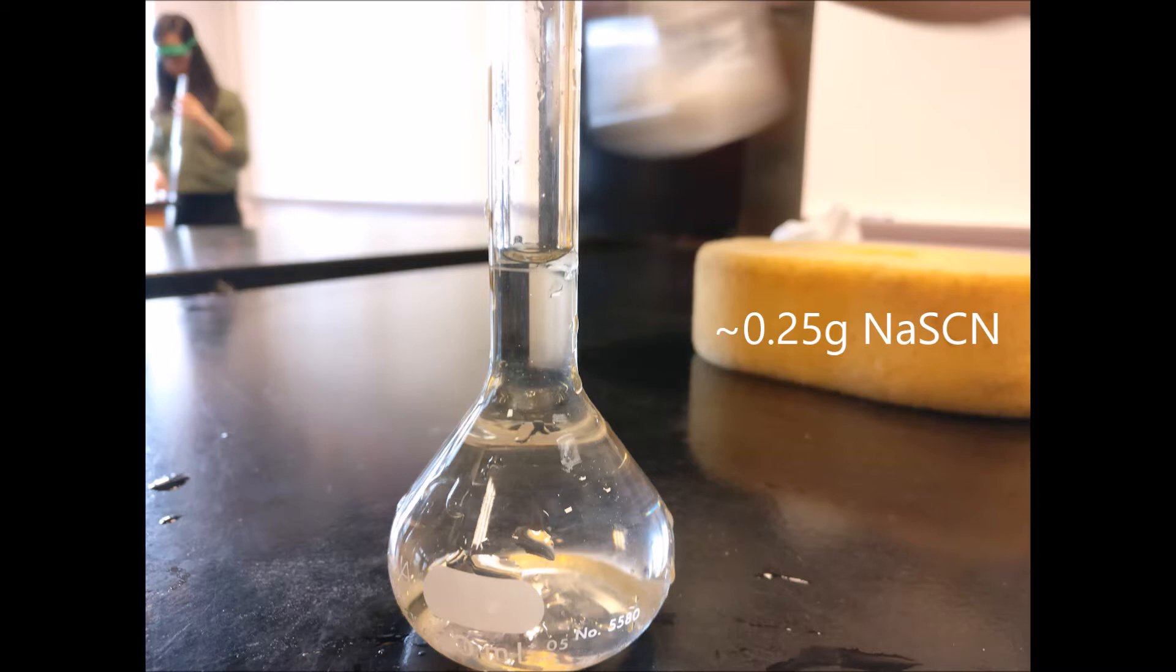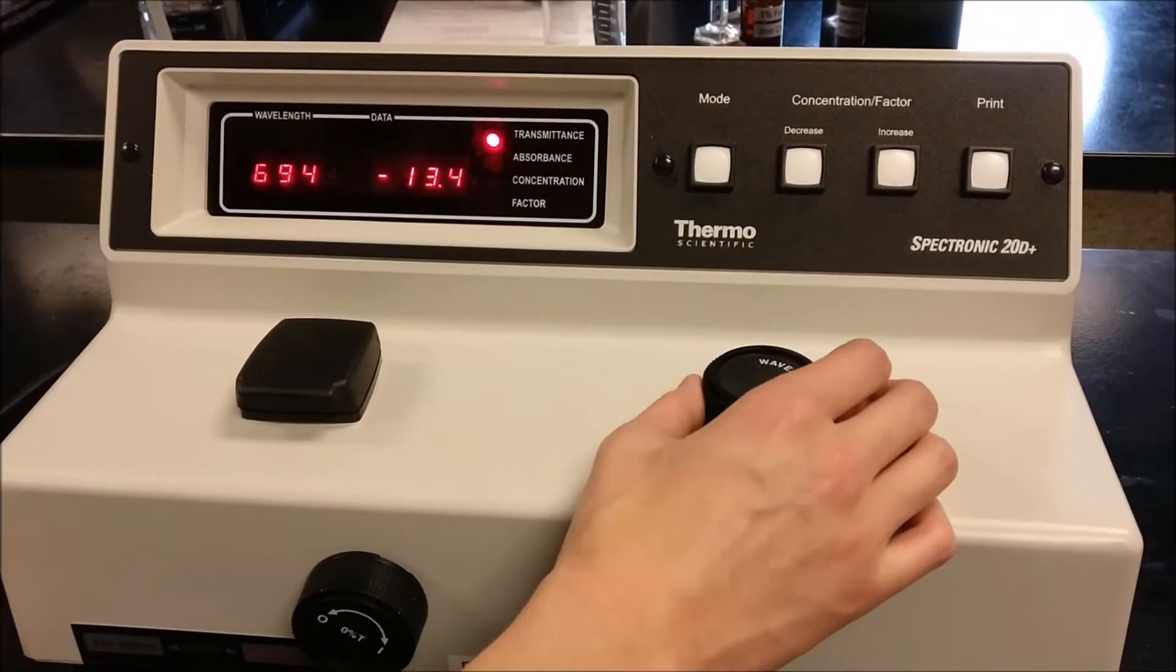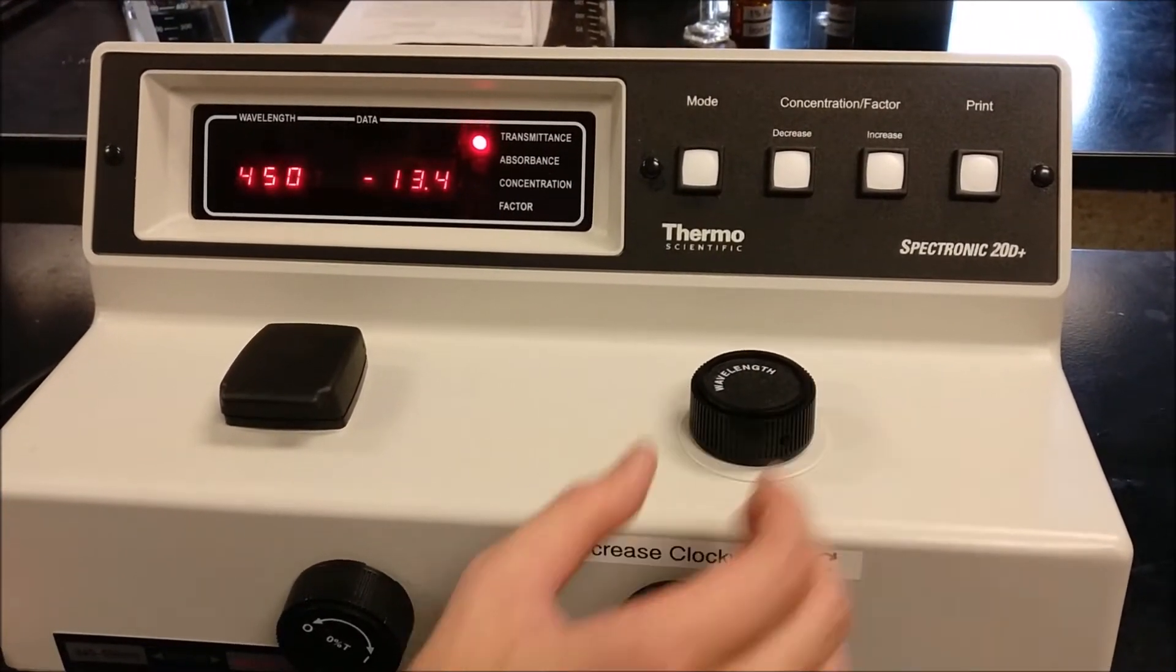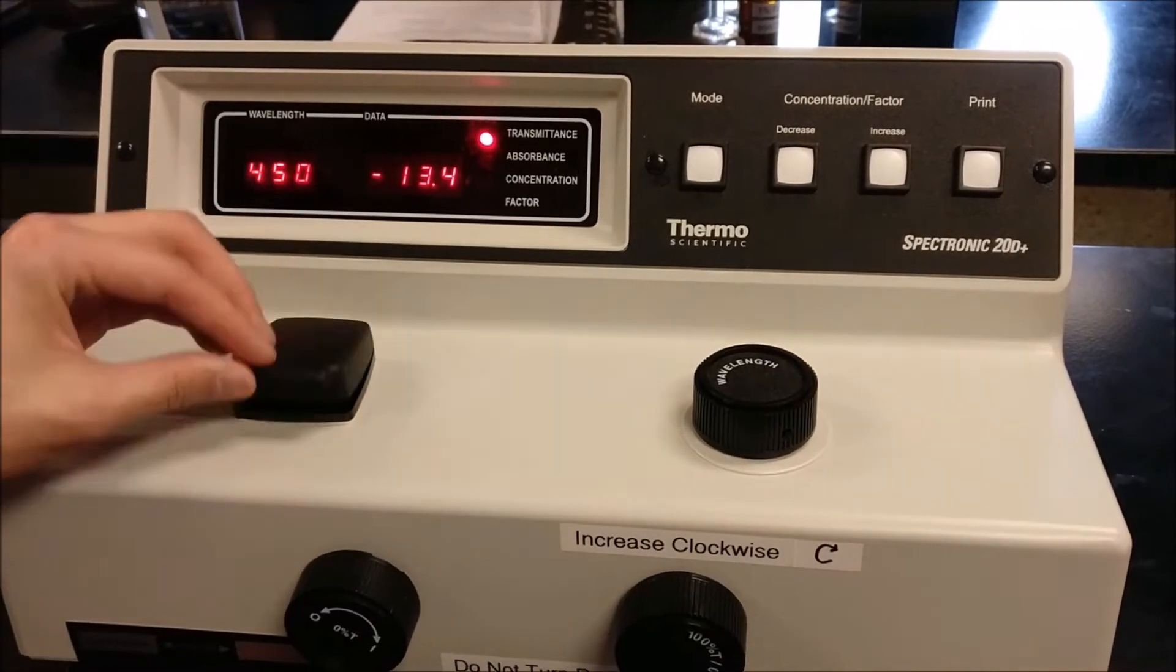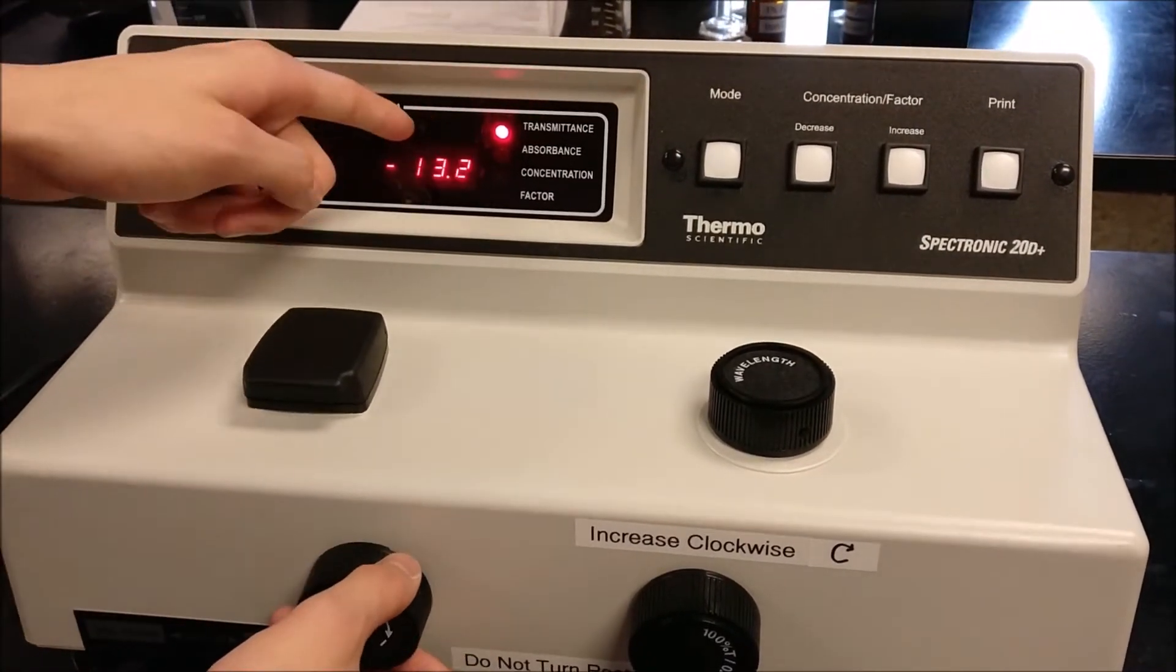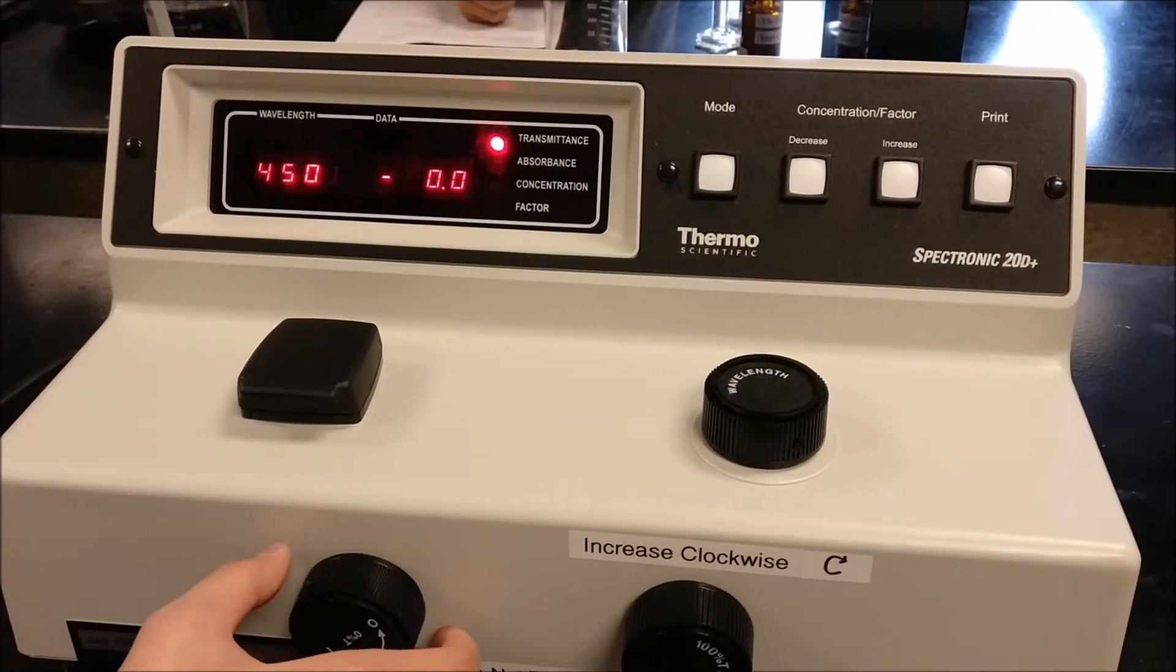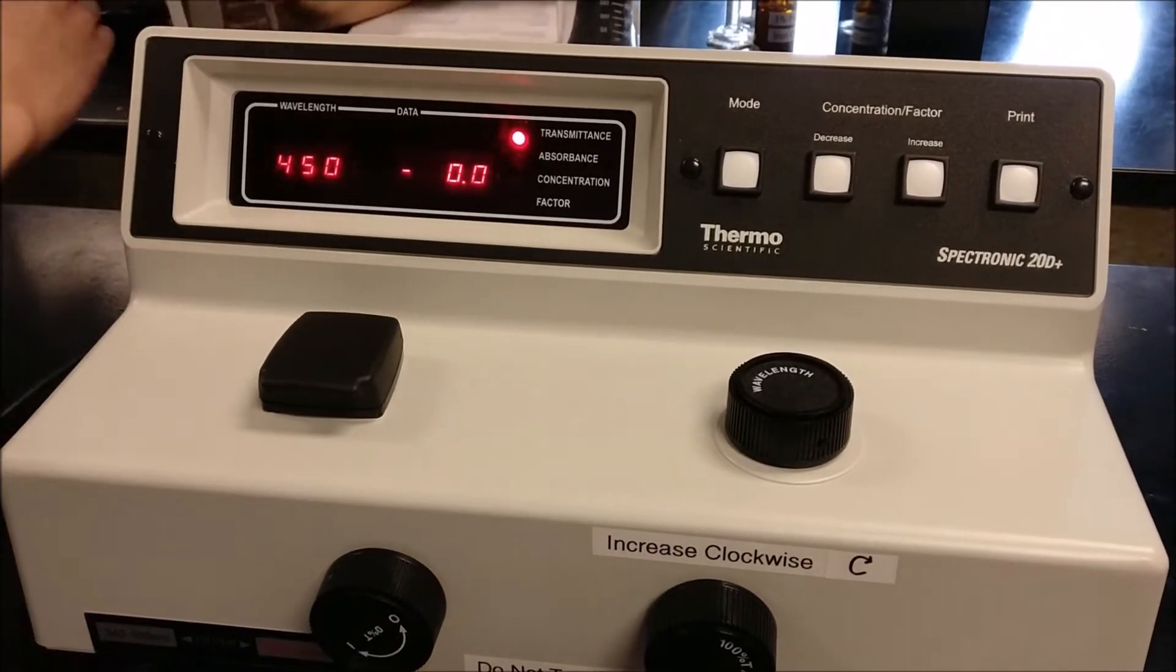In order to calibrate the spectrophotometer, we need to set the wavelength to 450 by turning the knob on the top. Make sure the mode is on transmittance, the sample holder is empty, and adjust the transmittance to 0 by adjusting the 0% T knob on the bottom left. The knobs are very sensitive, so slight adjustments will work.